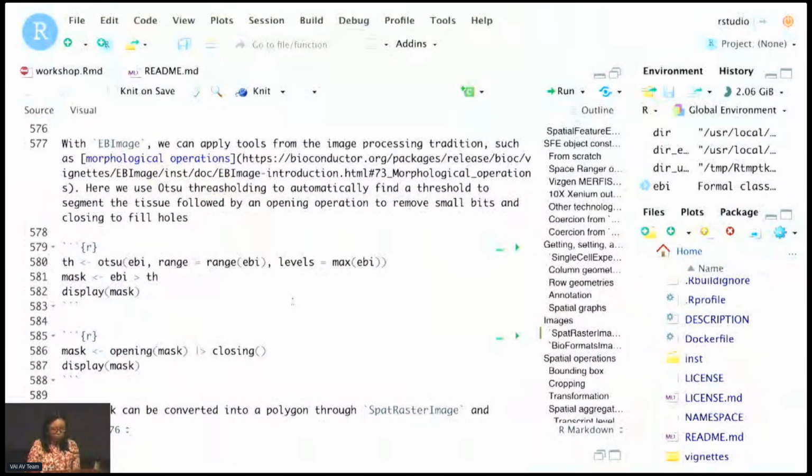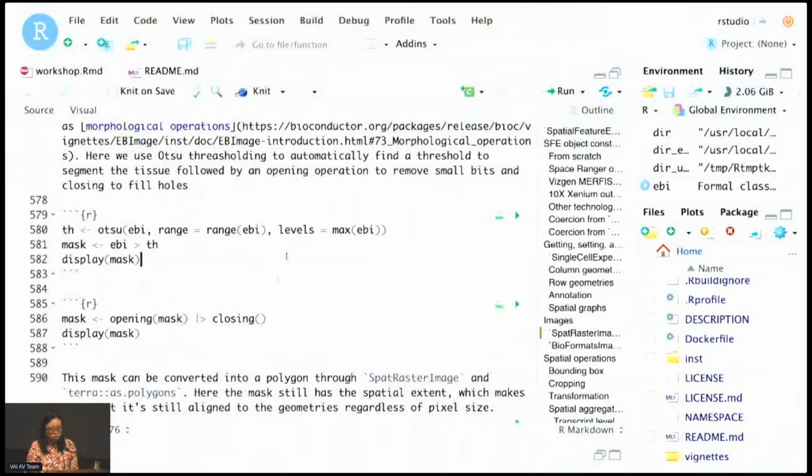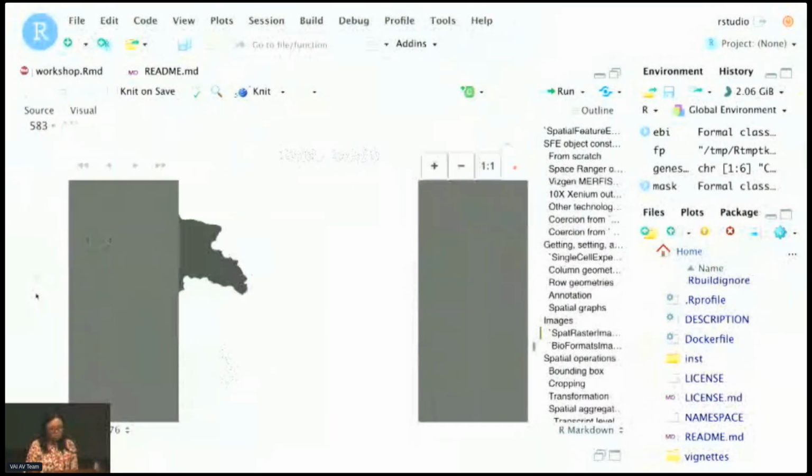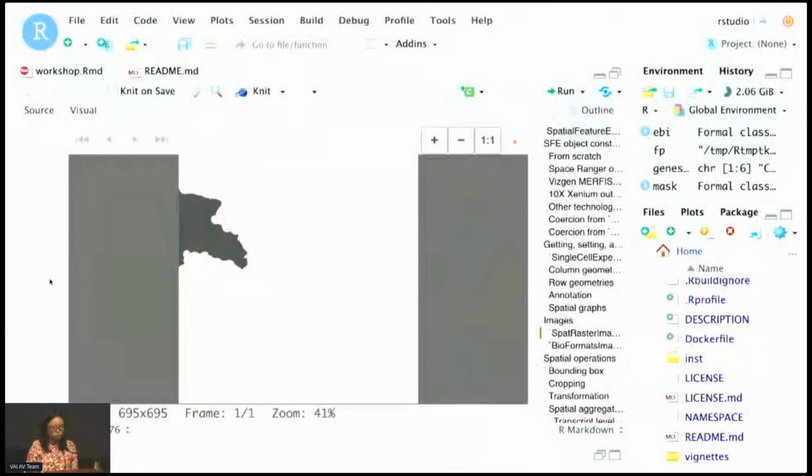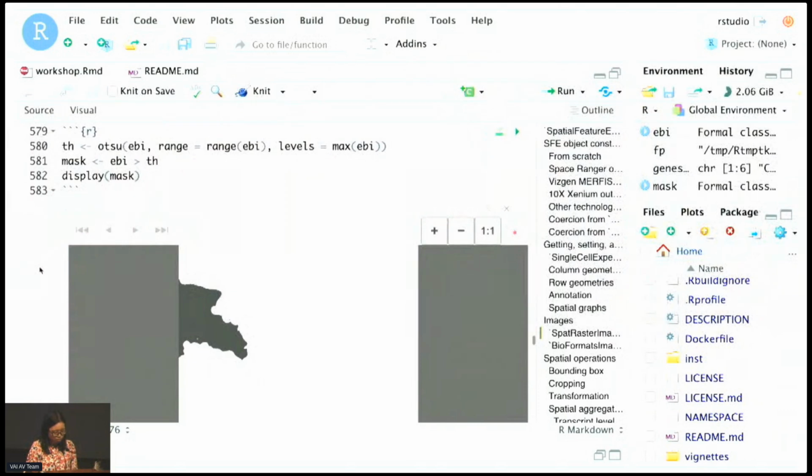So with EBImage, we can apply more methods from the image processing tradition. Like here, I'm applying Otsu thresholding, a way to automatically detect the threshold for segmentation. Here, I just want to distinguish the tissue from empty space with Otsu thresholding.